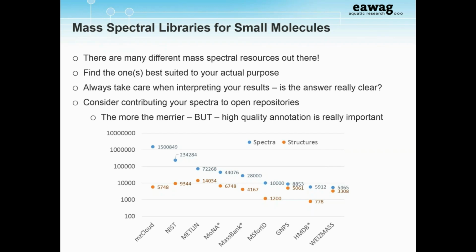Yes. So again, this is where the libraries can help you by also printing structures next to the fragment so that you can see if that fragment is really distinctive for that molecule, or whether, for example, if the fragment is just a benzene ring, it could be any molecule. Yes. So again, it's basically a visual reality check at the end, and this is much more difficult if you're doing high throughput data. Working on decent values to communicate to the user your confidence in high throughput is going to be really important in the next few years in metabolomics.